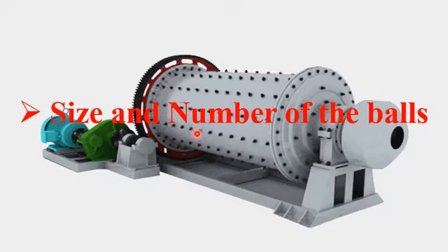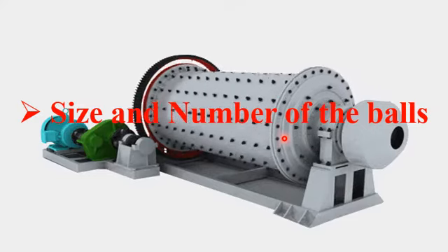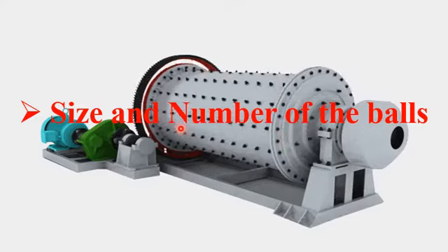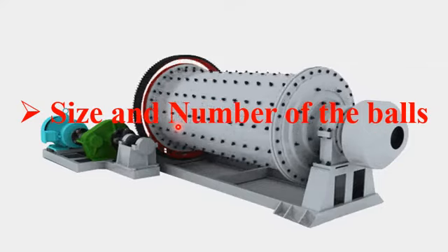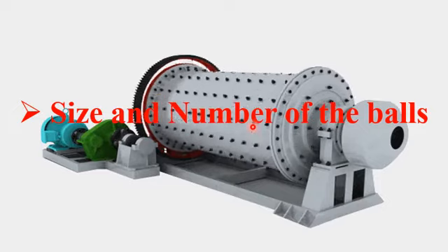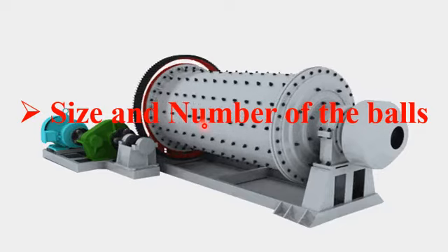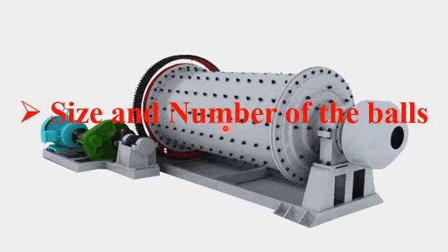Similarly, dear student, the number of balls in the ball milling process is also important. Let's say we are using a small amount of balls in the ball milling drum or machine. They will take too much time to crush the bulk material into nanoparticles. So please note that the grinding time will increase if we use a lesser number of balls.